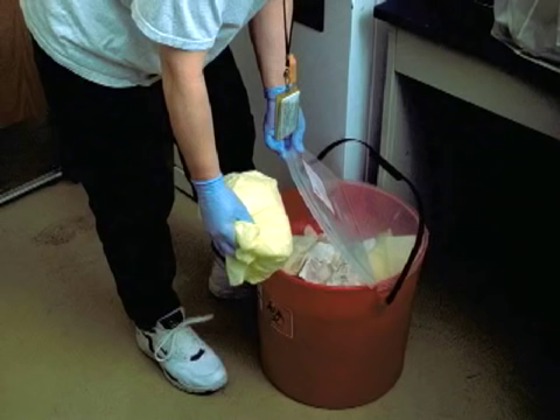If you are splashed with infectious material during a spill, immediately remove all contaminated clothing and dispose of them as biomedical waste or autoclave them.